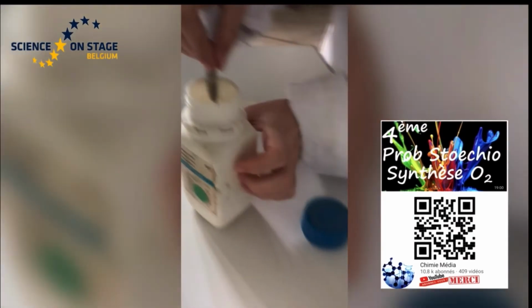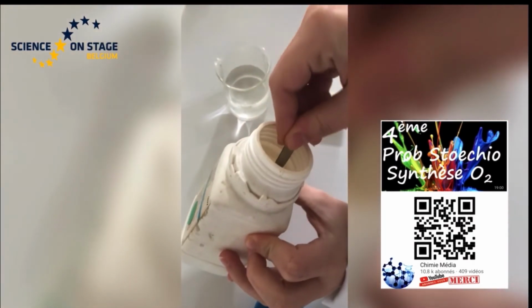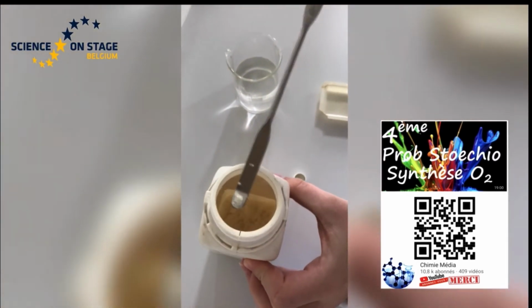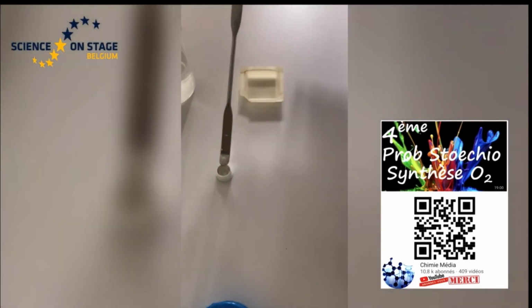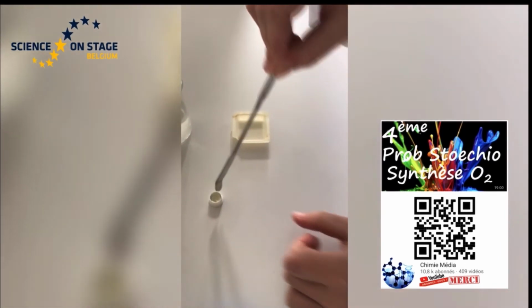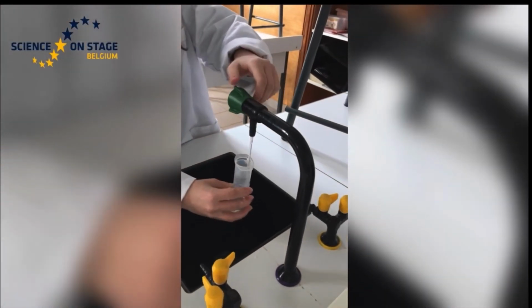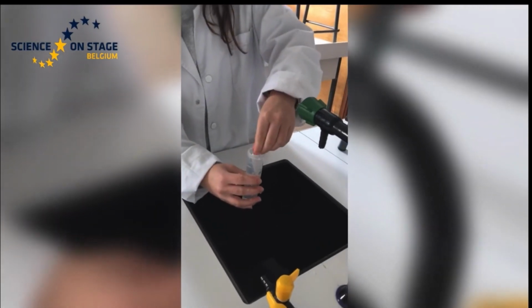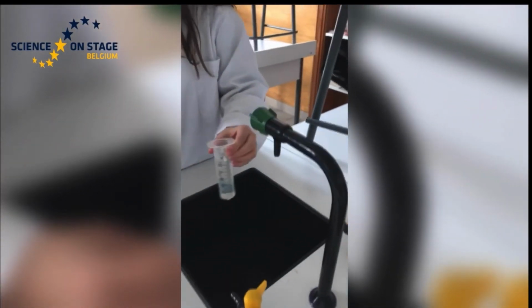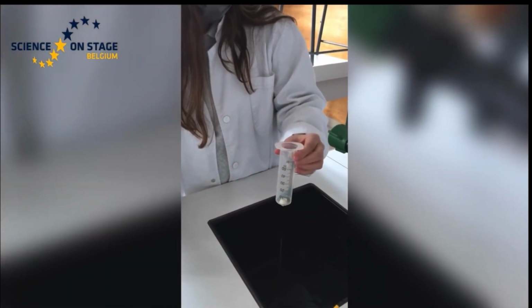To obtain oxygen, the solid reagent is potassium iodide. We put a little in the white container that is lowered in the syringe. The quantity is not important. It's a catalyst that will accelerate the dismutation of hydrogen peroxide into oxygen and water. We fill the syringe with water, we put the small boat, we make it go down to the bottom of the syringe, and then the plunger is gently inserted without overturning the small boat.